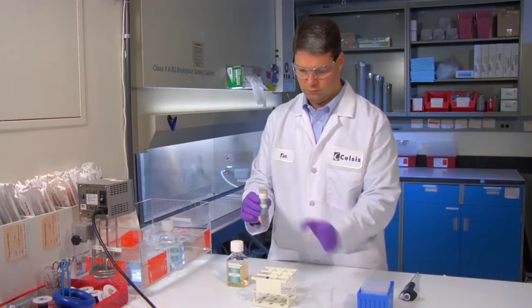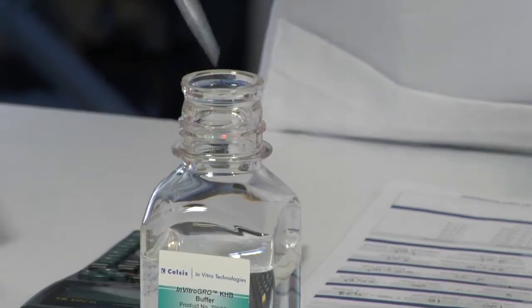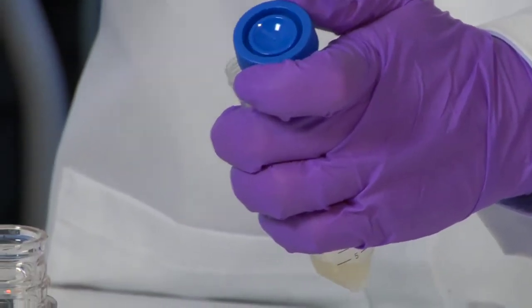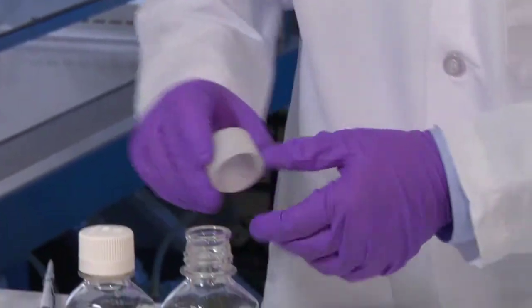Discard the supernatant by either pouring in one motion or aspirating using a vacuum pump. Add two milliliters of in vitro grow KHB buffer and gently swirl the centrifuge tube to resuspend the hepatocytes. The cells are now ready to use for the trypan blue method of cell counting.